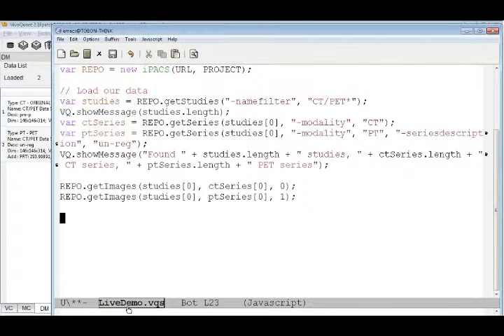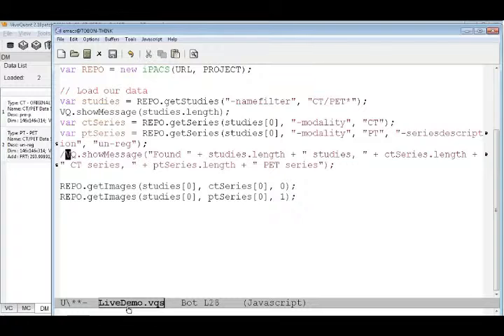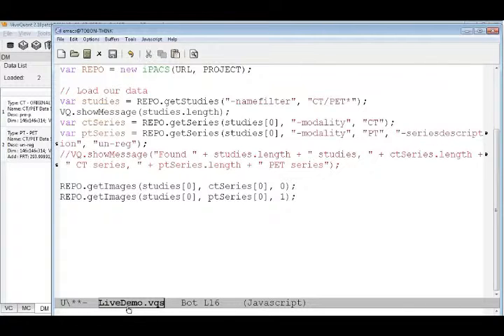Okay, so now that we have the data loaded, let's get rid of these helper messages. You can comment them out with a slash. And what was my next step? It was saving QC images. Save QC images. Good to stay focused.